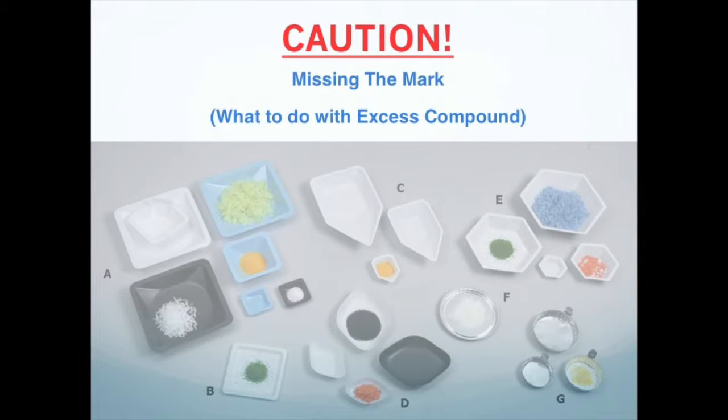If you overshoot your target mass, do not transfer any solids back into the original container. This might contaminate the stock reagents with dust or moisture from the outside. Instead, transfer some excess compound to a classmate who has not yet weighed out their reagent. This will allow you to conserve reagents instead of simply throwing them away, while being considerate of your lab mates by sharing.